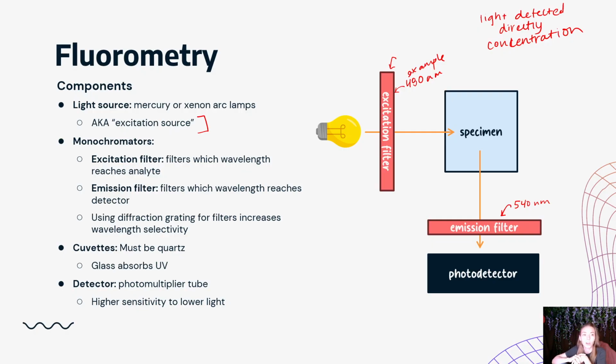Other things that can cause an issue, you can have like ethanol. Ethanol absorbs UV and can cause problems. So if you have an ethanol as a solvent within your solution, that can cause an issue.